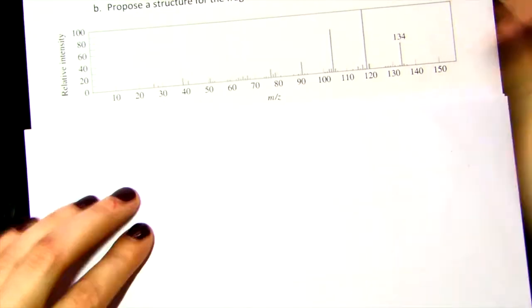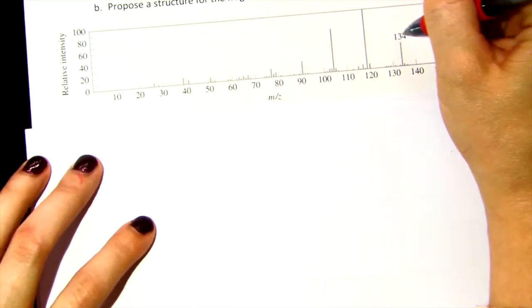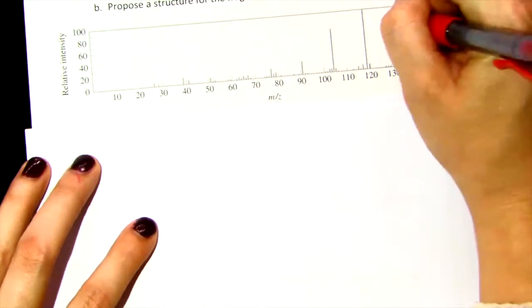We want to find our molecular peak. This one's labeled for you. It's right here. Here's M, 134. Again, it's usually the tallest peak that's farthest to the right, in the farthest cluster. So M is 134.